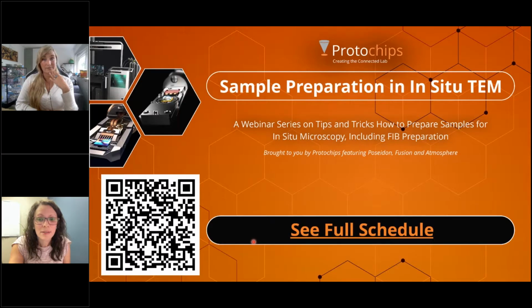Hello. I'm working on hydrogen embrittlement of aluminum alloys in humid air. I would like to ask if there's a limit to the amount of relative humidity that can be achieved with a gas cell.